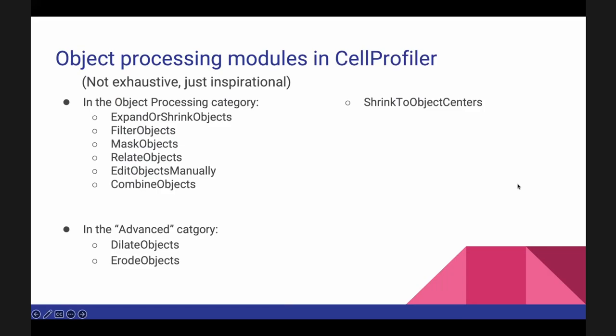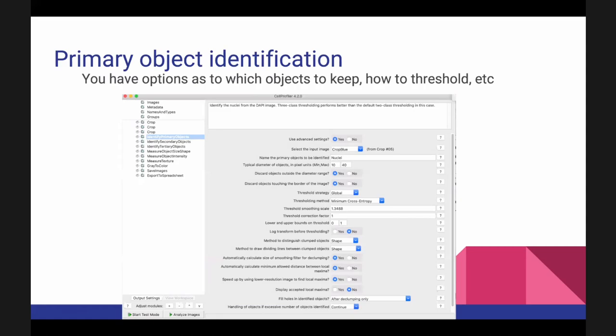Once you have your segmentation, CellProfiler offers many ways to work with your objects. You can filter them — for example, keeping only cells that have green dye inside them. Or you can edit the output of a segmentation that did an okay job but wasn't great. So once you've created a segmentation using all those settings, there are many ways to manipulate and refine it.